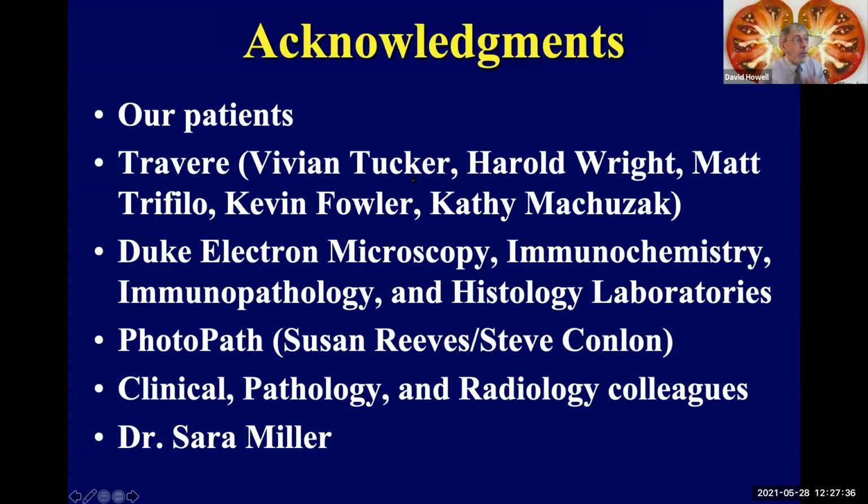So it depends on the center that's sending the tissue. We have one center where there's a group of radiologists who say the way we want to do it is to take one core for each study. So we get one for light, one for fluorescence, and one for EM. So that's a case where we get one. Ideally, we like to get at least two cores, usually two cores, and apportion some tissue for light microscopy from both of those cores.